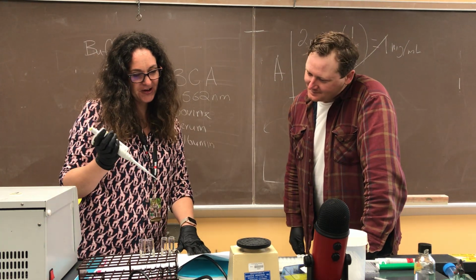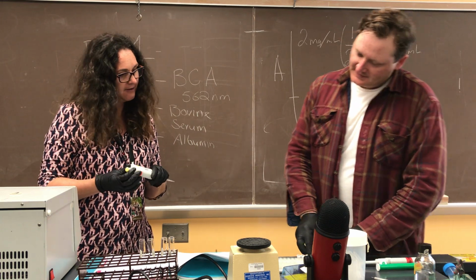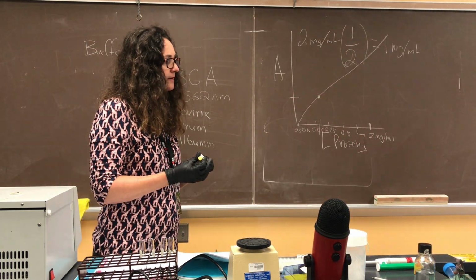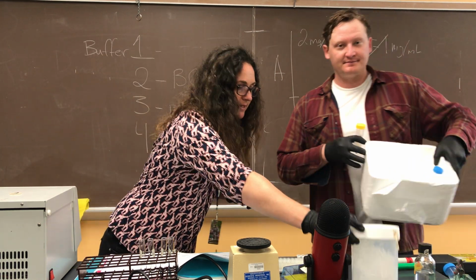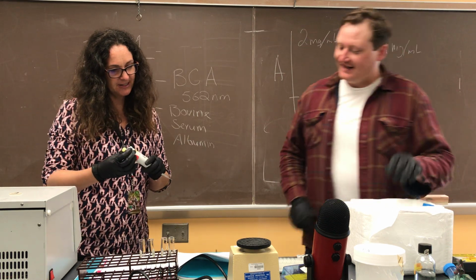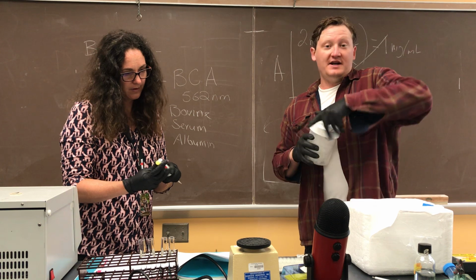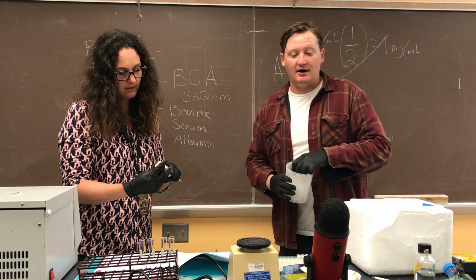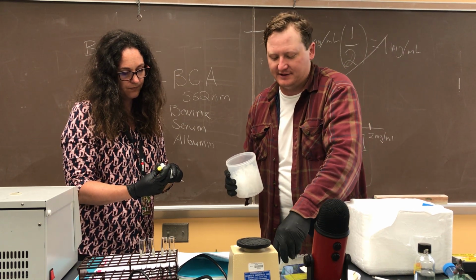Alright, so now we turn the page here, and we are going to retrieve our E. coli sample. That would be this one, correct? So we have it sitting on ice here, just to keep it nice and happy while we are messing around. Okay, and we need 4 tubes. While we're attempting to lyse these cells, first we want to get all the cells concentrated so they're not all spread out through a solution, right?